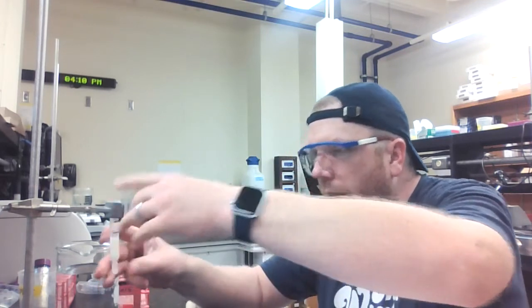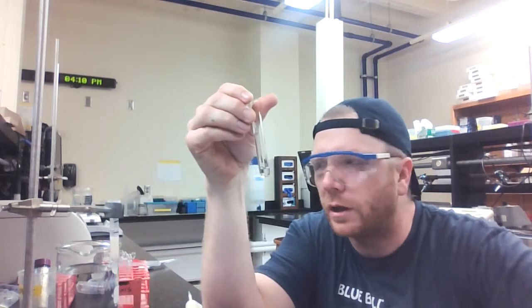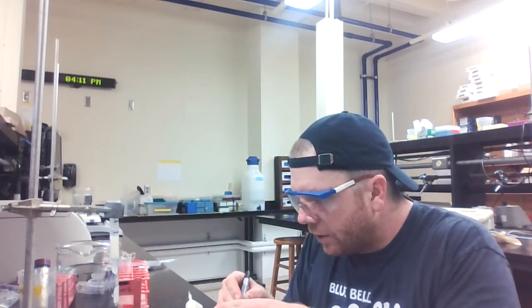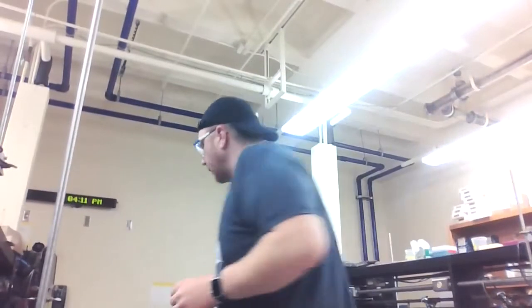Okay, so this sample right here, if I were to put money on this, do I expect there to be protein in here? Well, if there is, it's a very, very low concentration. The reason for that is my elution buffer has a sodium chloride concentration of 0.25 molar. The solution that has made it through the stationary phase of my column is actually a mixture of the wash and the elution buffer. So it's going to take a little bit more of that solution to flow through for my column to really show the impact of that 0.25 molar elution buffer. So I'm going to add more of it to my column.